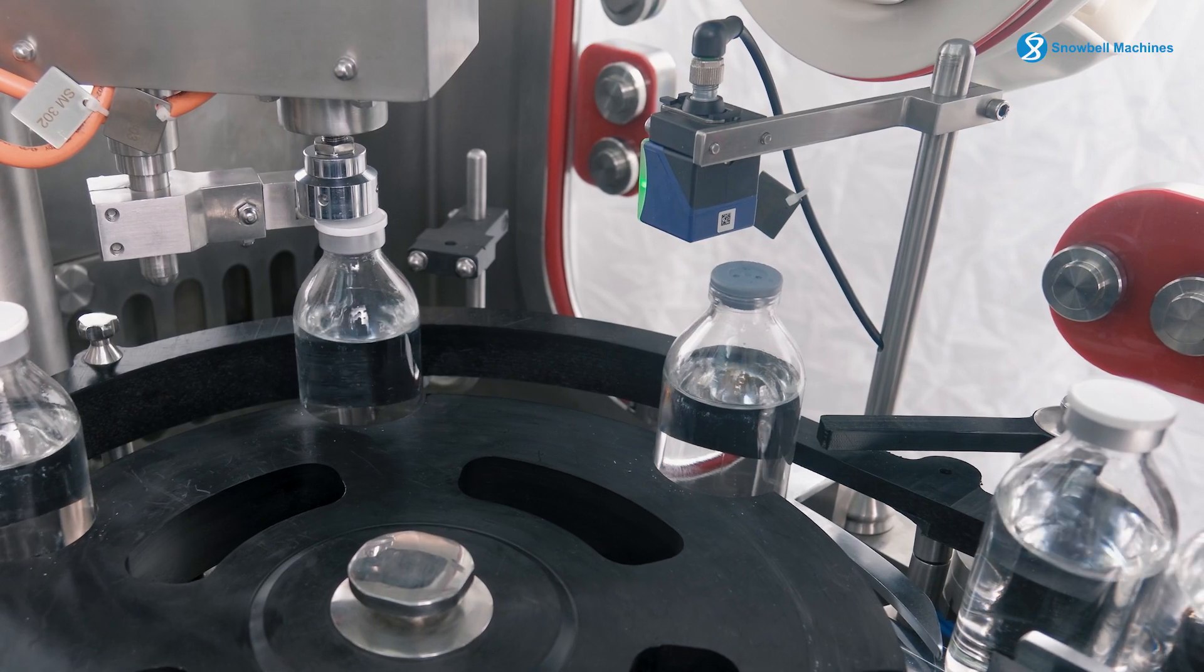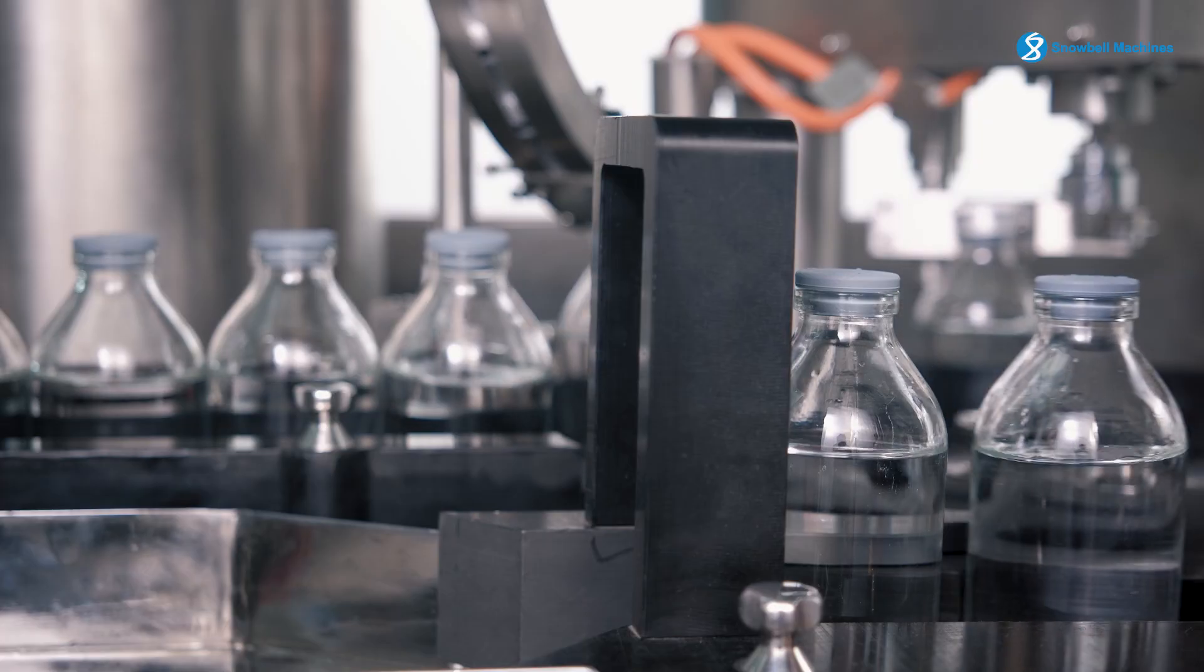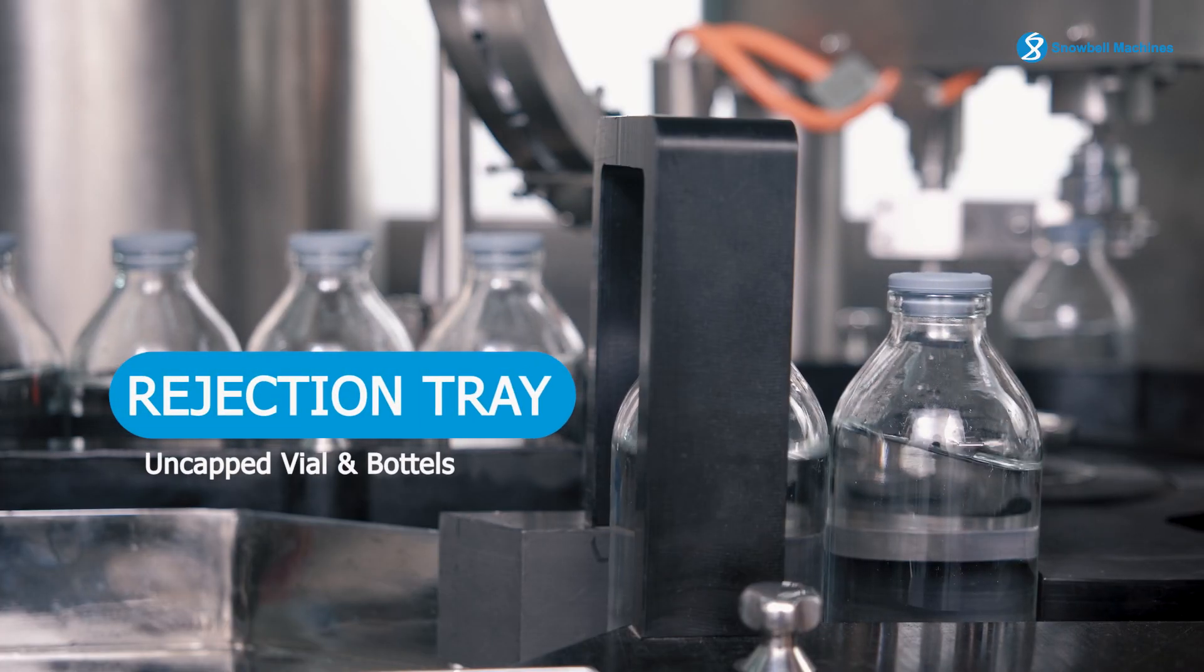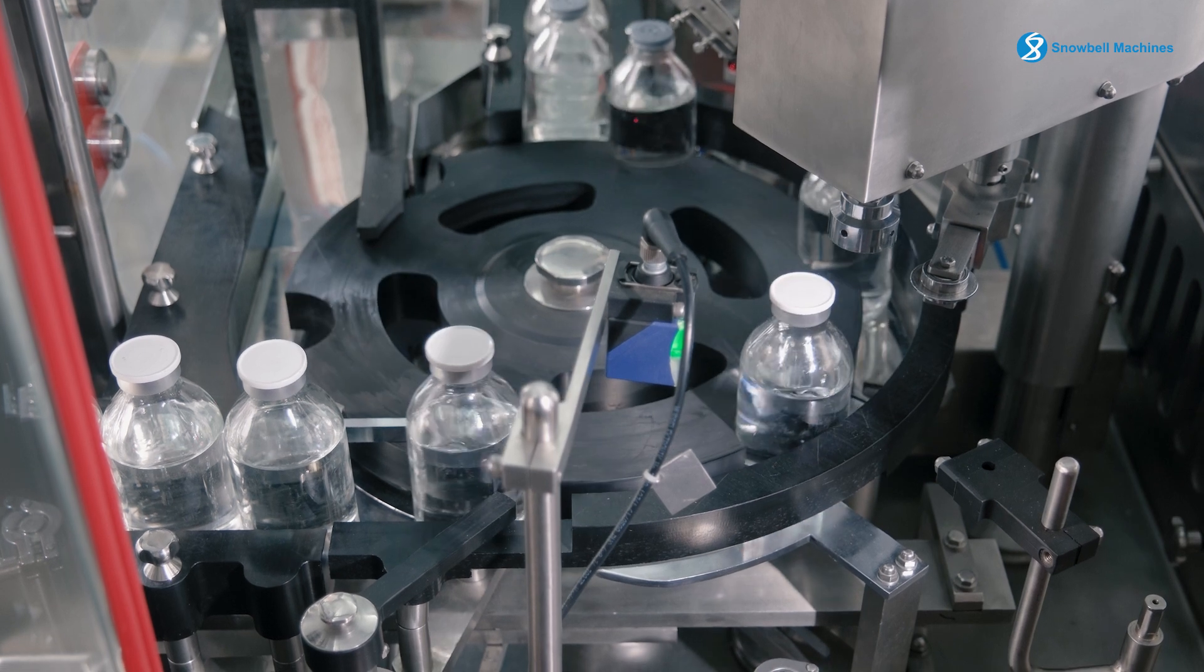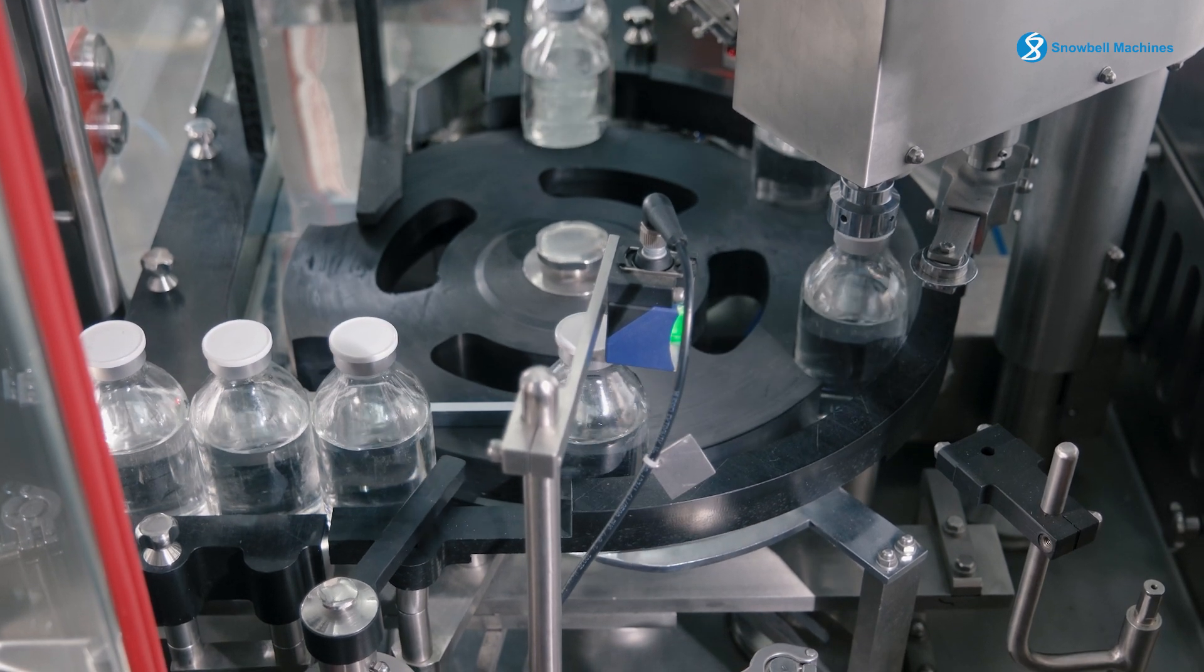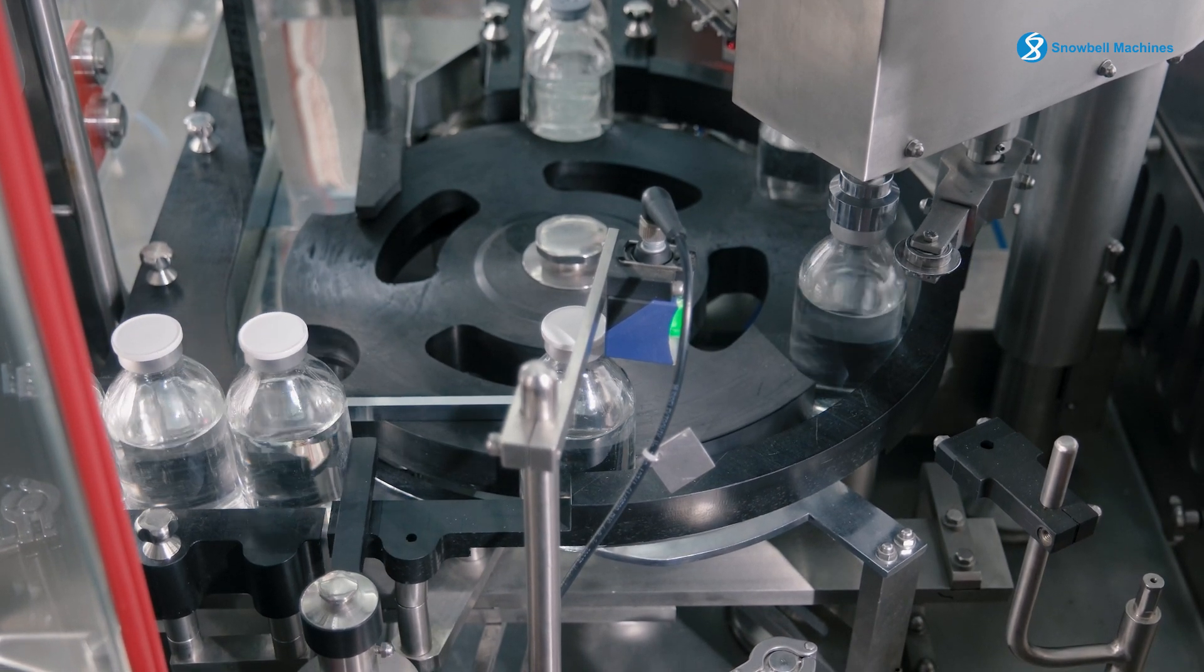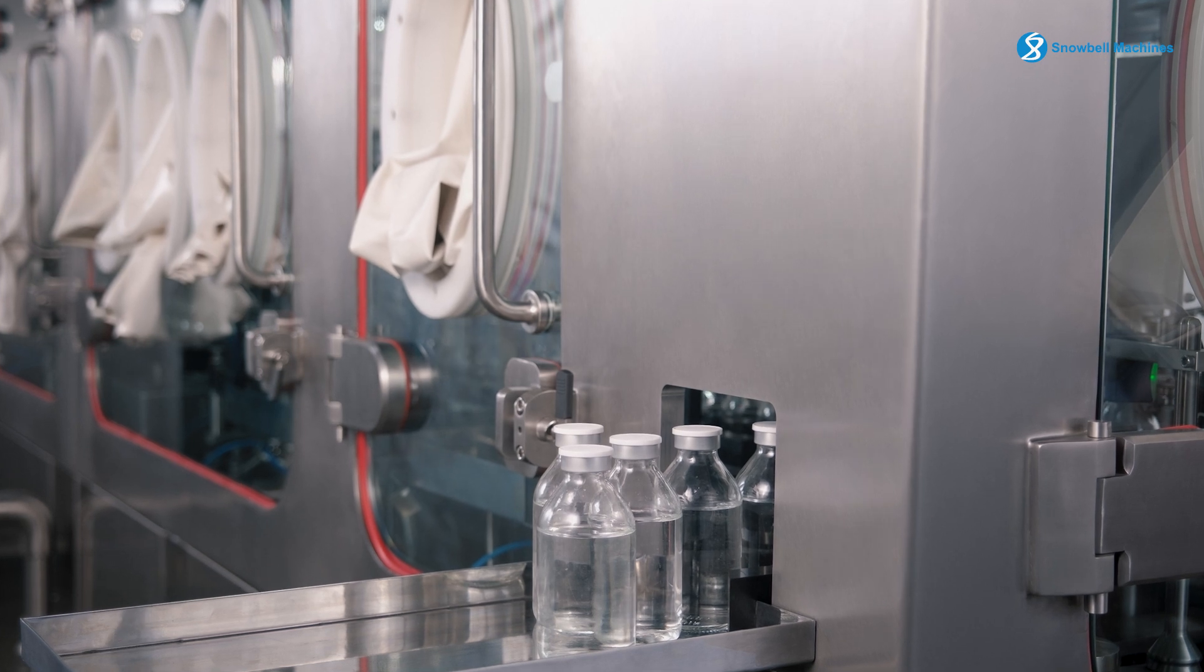The rejection system removes the uncapped vials and bottles into a rejection tray. The accepted vials and bottles are collected in a collection tray installed outside the isolator.